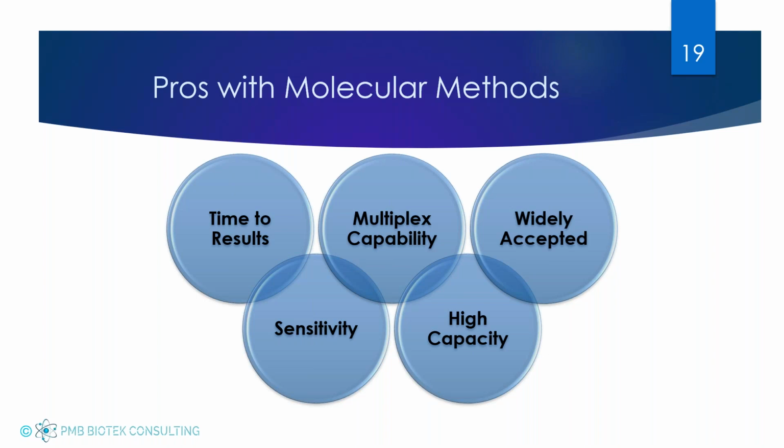The multiplex capability, I think, is the number one, and Aspergillus is the greatest example of this. Having a mycologist on staff or having an individual that can look at agar plates and really tell you which of the four main target species of Aspergillus, that is not something most labs will do. They'll run PCR, maybe a multiplex or a singleplex and then a multiplex, do a repeat analysis if they have a positive hit, and then they're comfortable moving forward with that. So you don't have to have all those classifications when you're looking at something under a microscope.